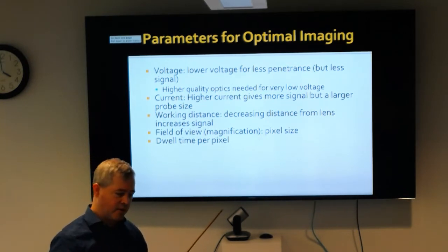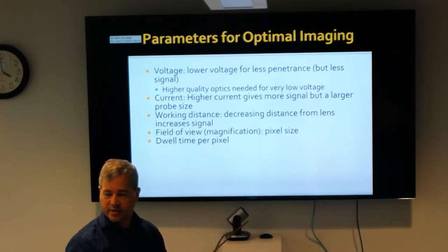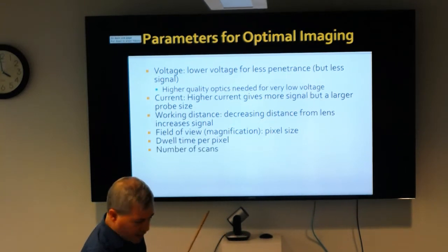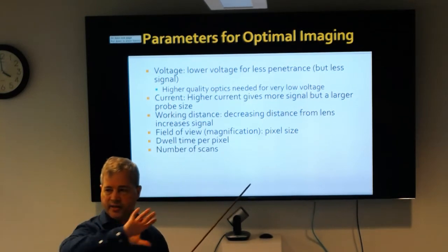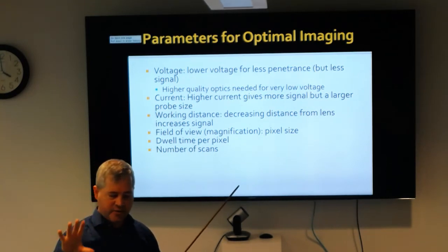So these are all things that have to be considered when you're setting up your imaging parameters. If you really want the best picture, it's going to take more time. You can also have it do a different number of scans. It can do a full scan and then another scan, and add those two together to again increase the signal.